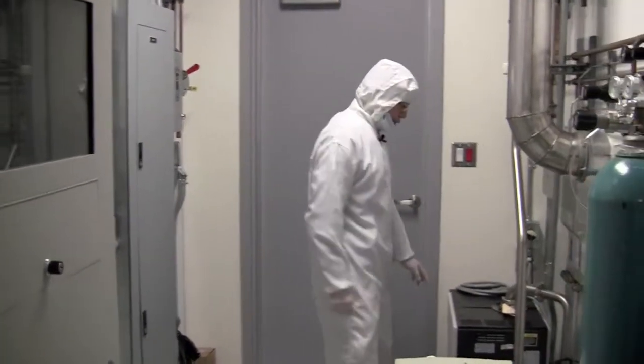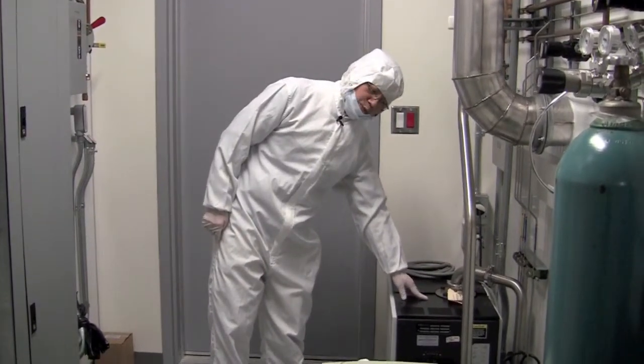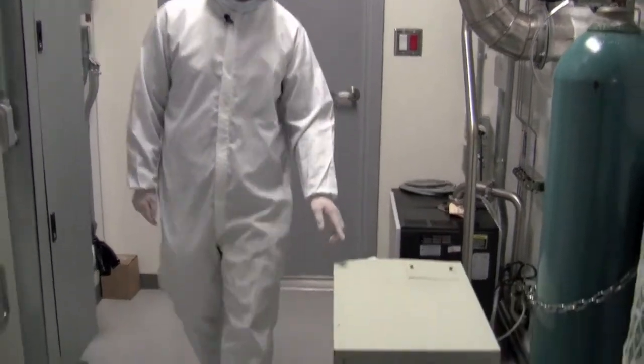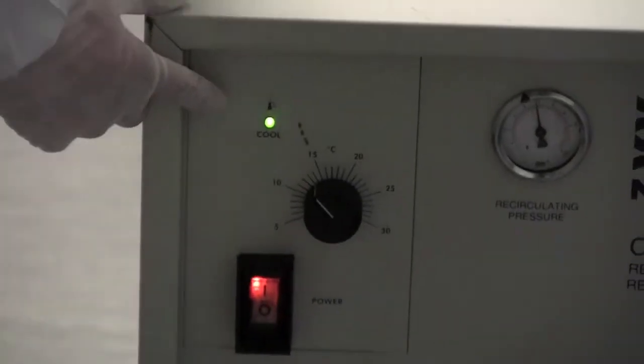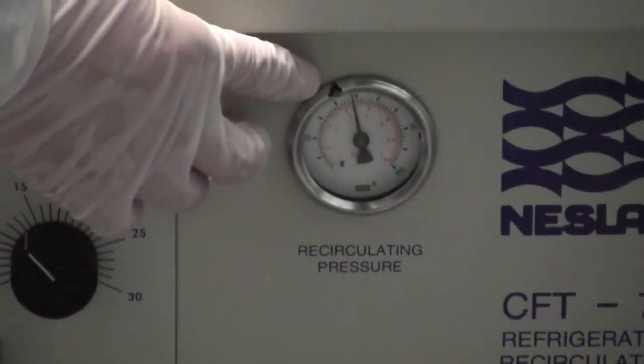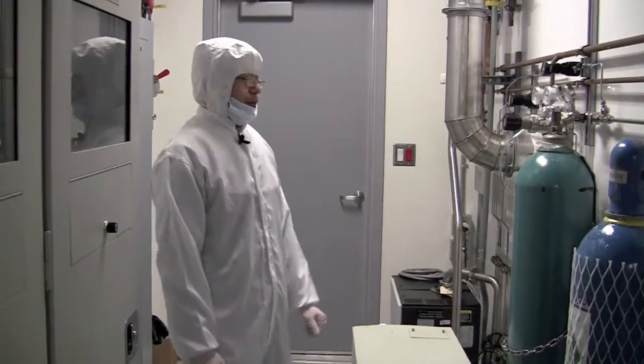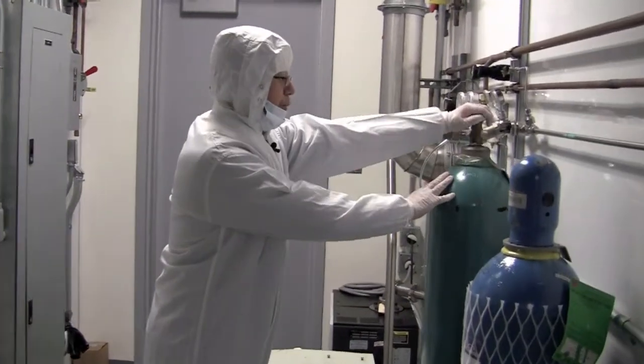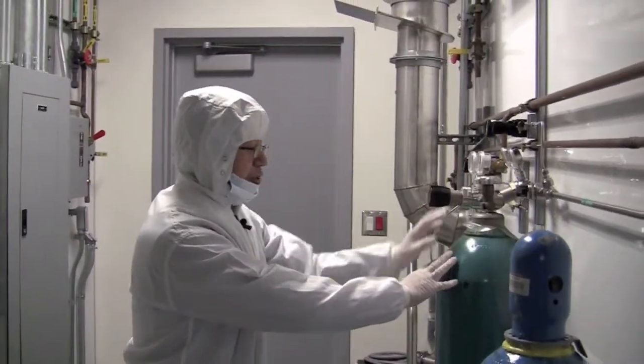For general users, we will first check the dryer pump is working. Check the chiller is on and the circulating pressure is pointing to the marked line. If everything is fine, we will counterclockwise open the valve of the oxygen tank.